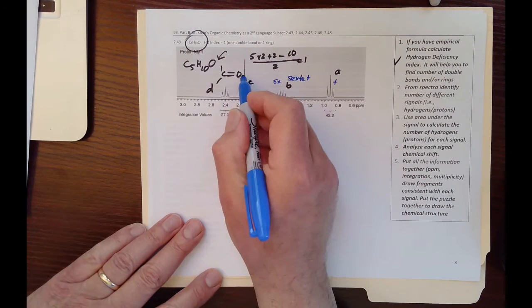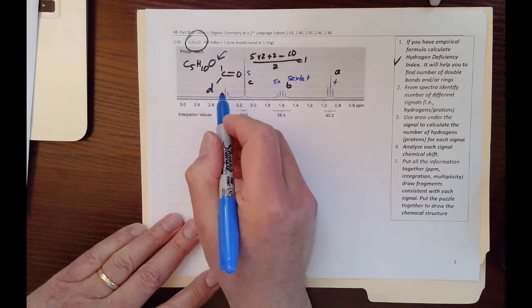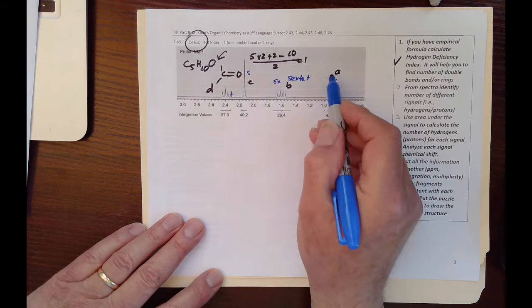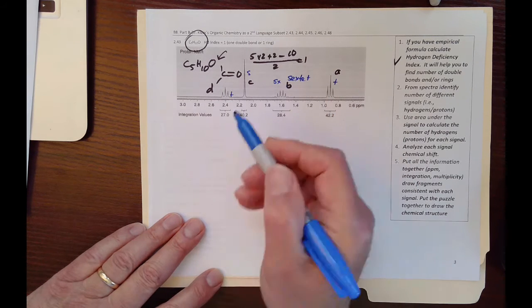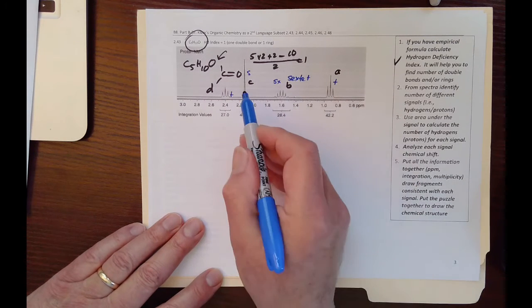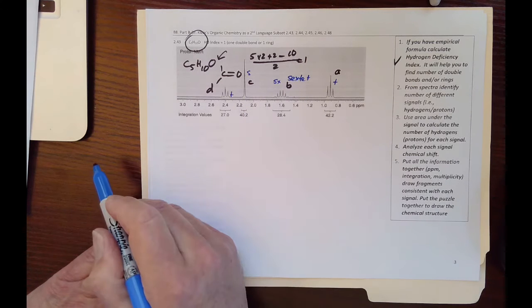Then we have a singlet here, and again, we have another triplet here. So we have basically 4 signals: a triplet, a sextet, a singlet, and a triplet.